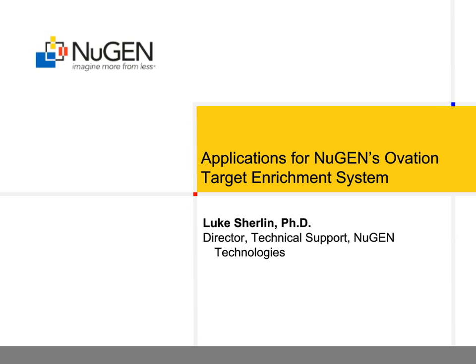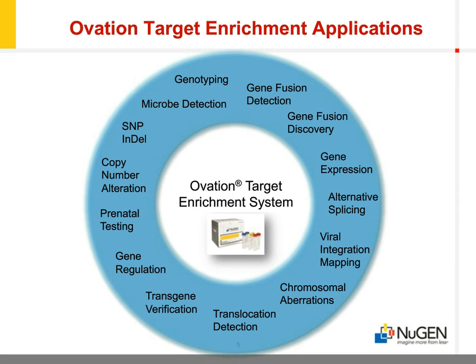Targeted resequencing is currently used to reduce sequencing costs by focusing on specific regions or events of interest within a genome. While the costs of sequencing do continue to go down, the costs associated with whole genome or whole transcriptome approaches in order to capture all the relevant information are still untenable for the vast majority of researchers. At the same time, it can be costly in terms of price, time, and sample to invest in multiple assays to approach all the different questions to be answered by the same DNA or RNA sequence.